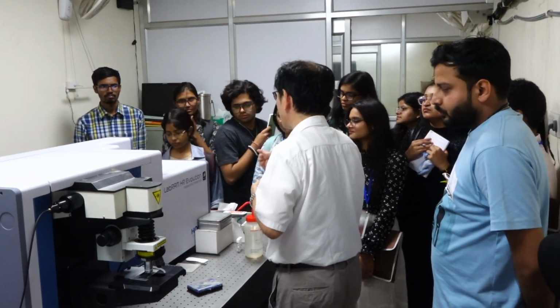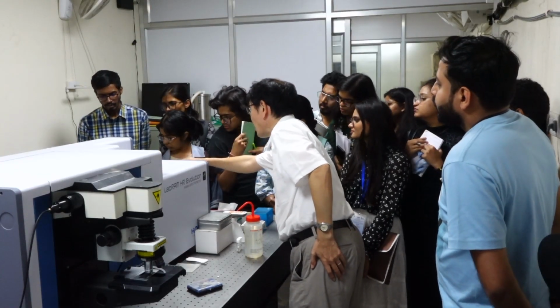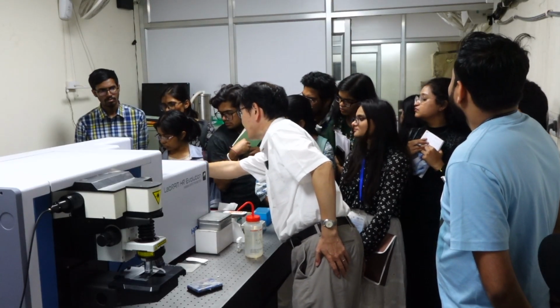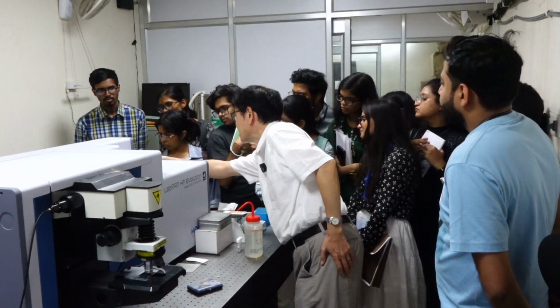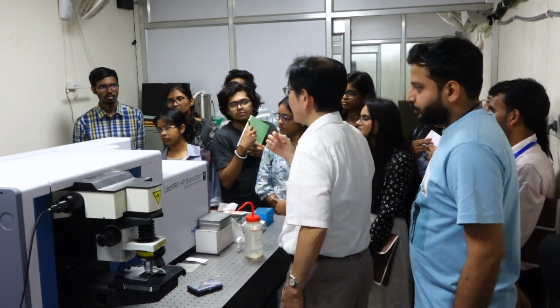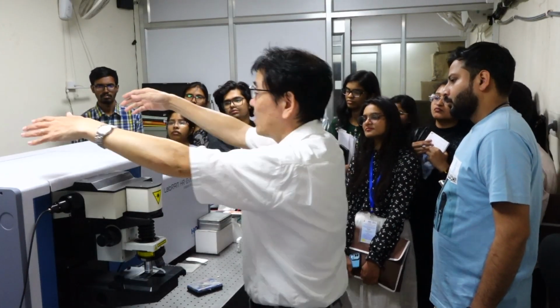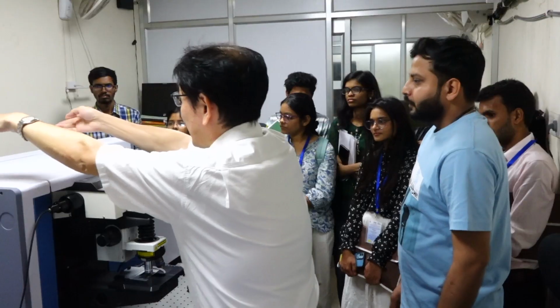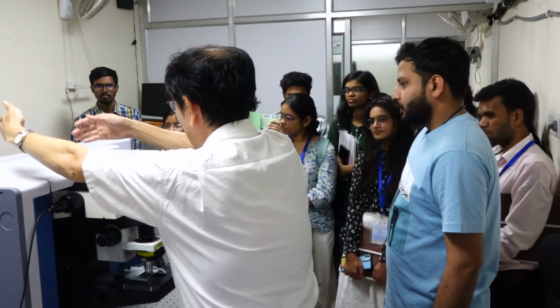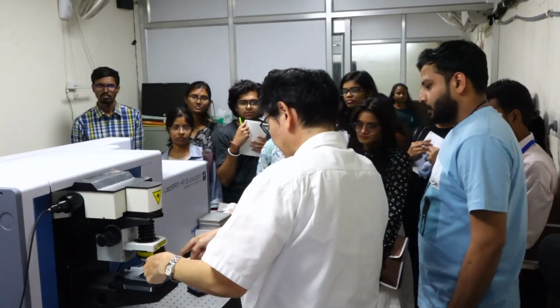So for safety, the output passes through the optical fiber and enters into the box. You can see it from around there. Okay. Then light comes into this box, and after being reflected by the mirror, it comes to the sample point here.